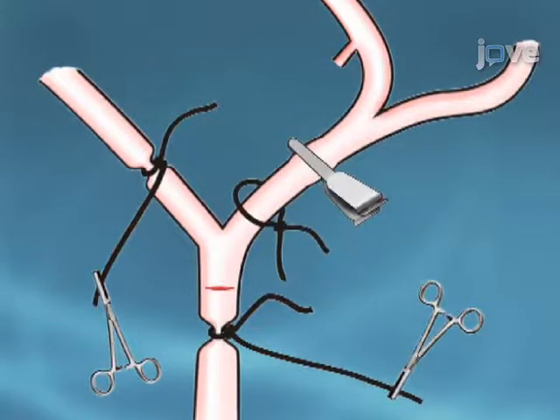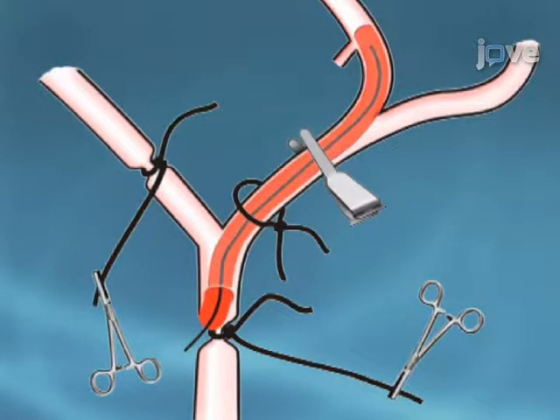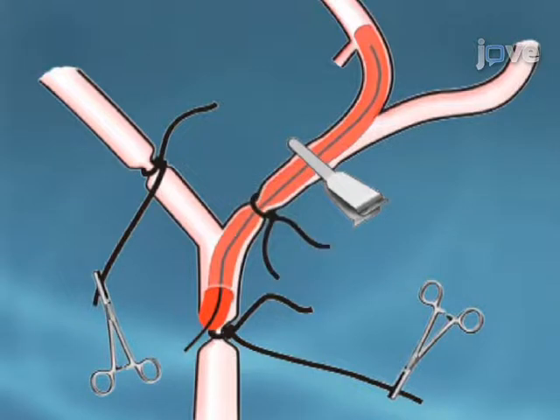The final step of the procedure is to introduce the filament into the circle of Willis. This blocks the branch of the middle cerebral artery. Ultimately, neurological deficits as a result of this occlusion can be identified through observing changes in behaviour.